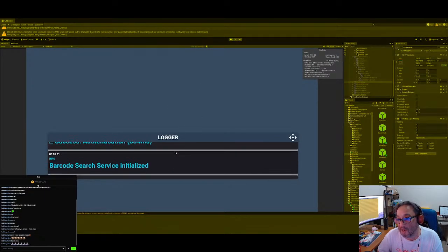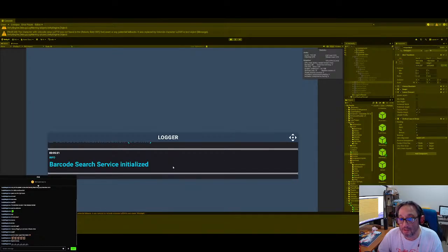So we did that with the logger, and we want to leverage this for the actual list of the tables, like sample. You could either paginate it or do infinite scroll. In infinite scroll, when you reach the end of the list, it just recycles and queries at the same time.